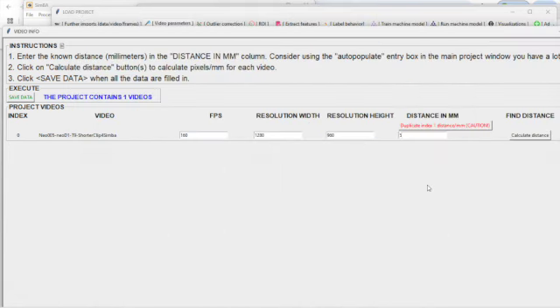And I know my spout was from here to here, 5 millimeters. So I'm just going to double left click at one end of the spout and double right click on the other. And I don't really love that line because it's a little angled. So I'm going to double click again to create the second point again. And I like this line, so I'm going to press escape to save that.